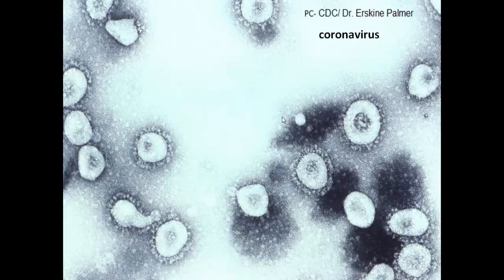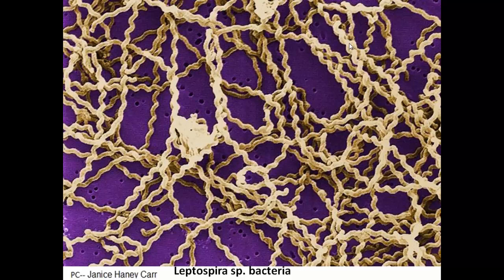These round bodies here are coronavirus. The 2003 epidemic of SARS was caused by coronavirus — it causes an influenza-like illness, and that 2003 SARS epidemic was caused by this virus.